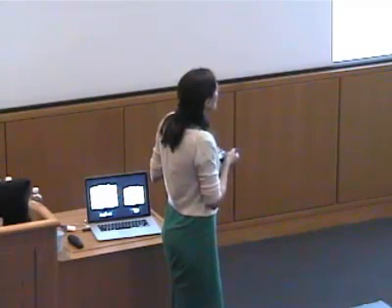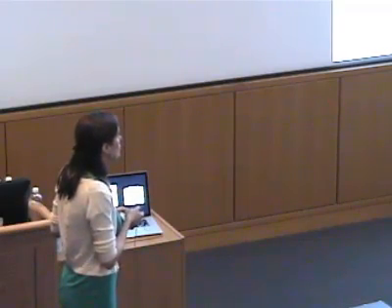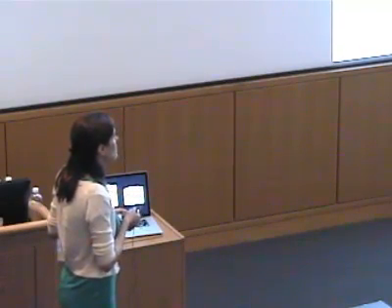Probably most of you are more familiar with EXAFS than with XANES analysis. One reason to be quite interested in XANES spectroscopy is that it requires a lot less data collection time. These are generally easier data to obtain. You can typically obtain these data on samples that are much less concentrated than what you need for a standard EXAFS measurement.